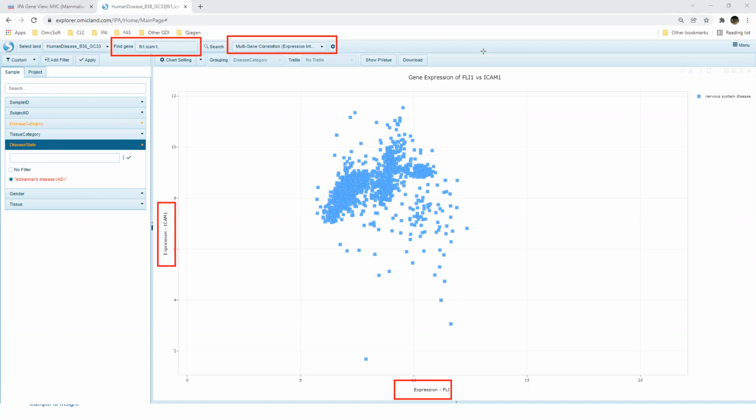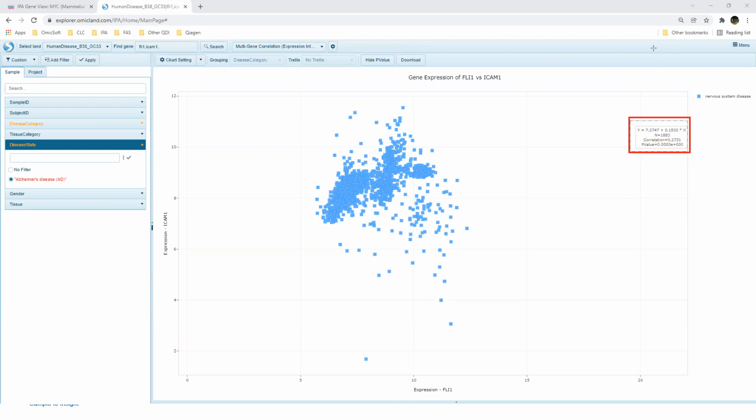And here, if you want to add some statistics to this correlation plot, you can click on show p-value, and this is going to show you the correlation. So it has very low correlation, of 0.2. So this was not the greatest correlation, but if you were working with something relevant to your research area, you might find the ones with high correlation as well. And you can easily export any of these images by clicking on these image icons. So any chart, any plot that we generate here, you can simply save it on your computer as an image.